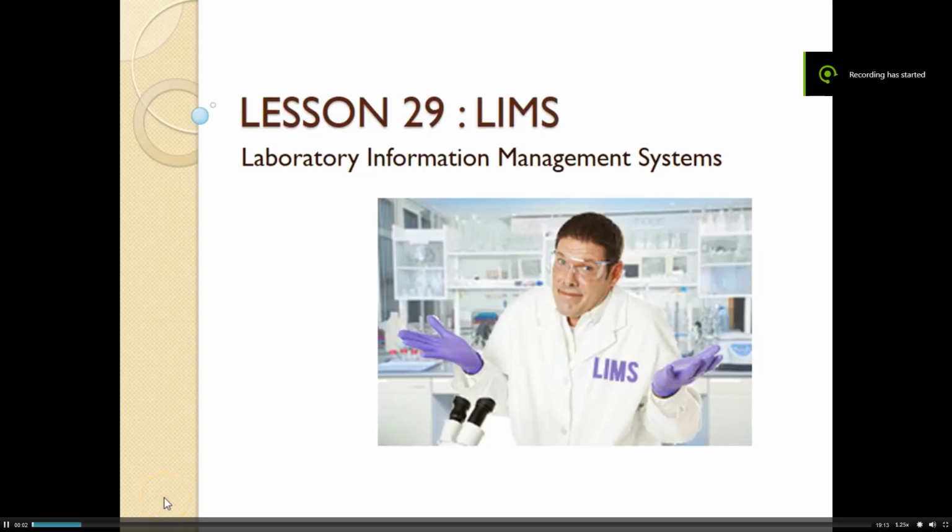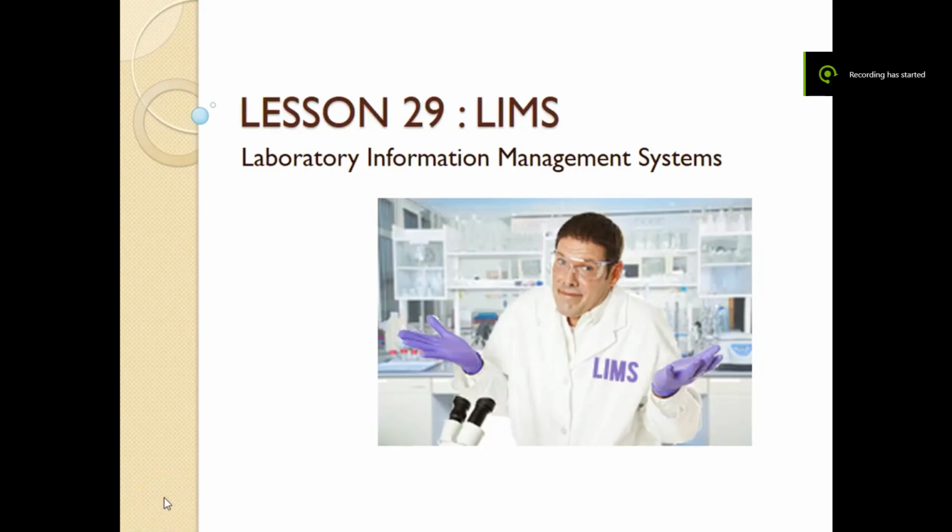Welcome to today's lesson, number 29, which is in relation to LIMS, or Laboratory Information Management Systems, that are used regularly in the laboratories.